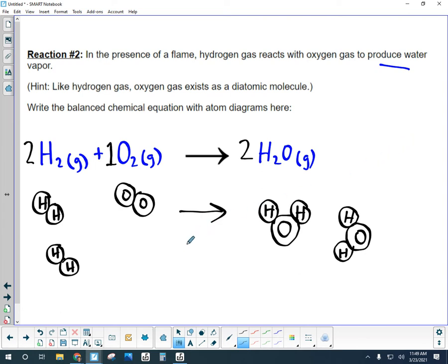So one thing to think about too is what's really happening is these bonds are breaking, and these atoms themselves are reforming. So it's kind of like a before picture and an after picture. The 4 hydrogen end up in a different place in a different molecule, but they weren't created, they weren't destroyed, they were just rearranged. All right, so I've got about 30 seconds left on my timer for our ignition of the bigger test tube.